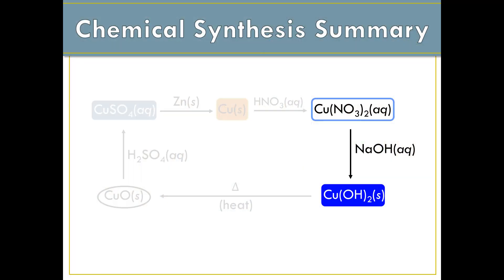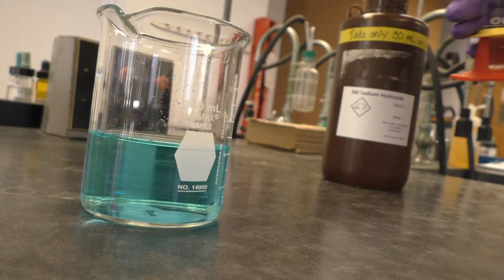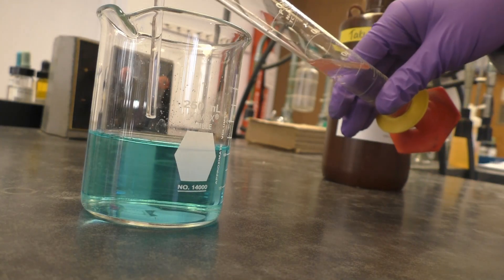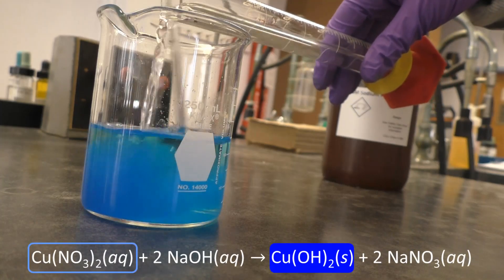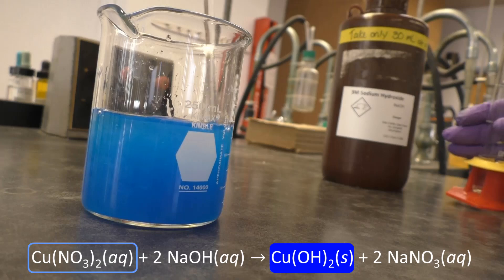The next step in our synthesis is to take our newly formed copper-2-nitrate and convert it to copper-2-hydroxide via an ionic metathesis reaction. To do so, all you need to do is add 30 milliliters of 3 molar sodium hydroxide. At this time, you should see a nice royal blue precipitate form. This is the desired copper-2-hydroxide product.